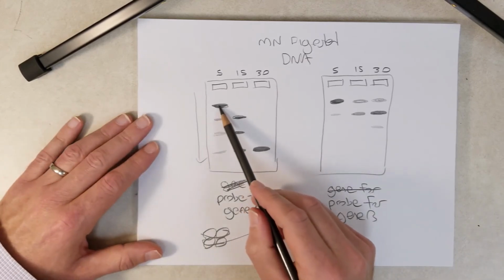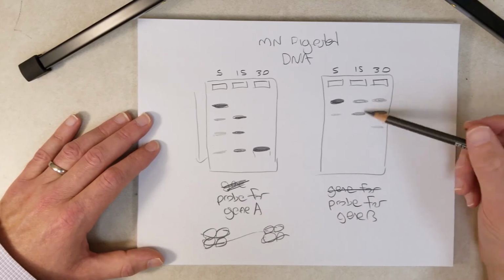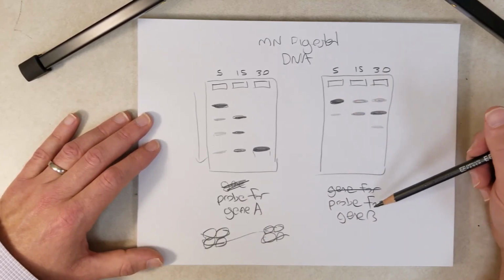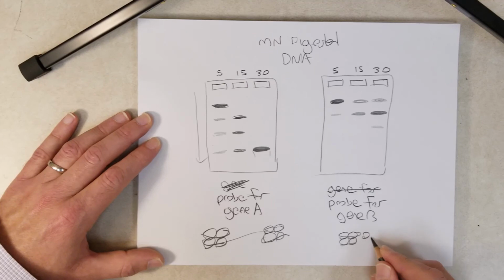So over time it was able to get to all that DNA and digest all the nucleosomes into single units, getting rid of all the linker DNA. But for gene B, micrococcal nuclease is having a really hard time separating the nucleosomes. The most likely explanation is that for gene B, the nucleosomes are really close together.